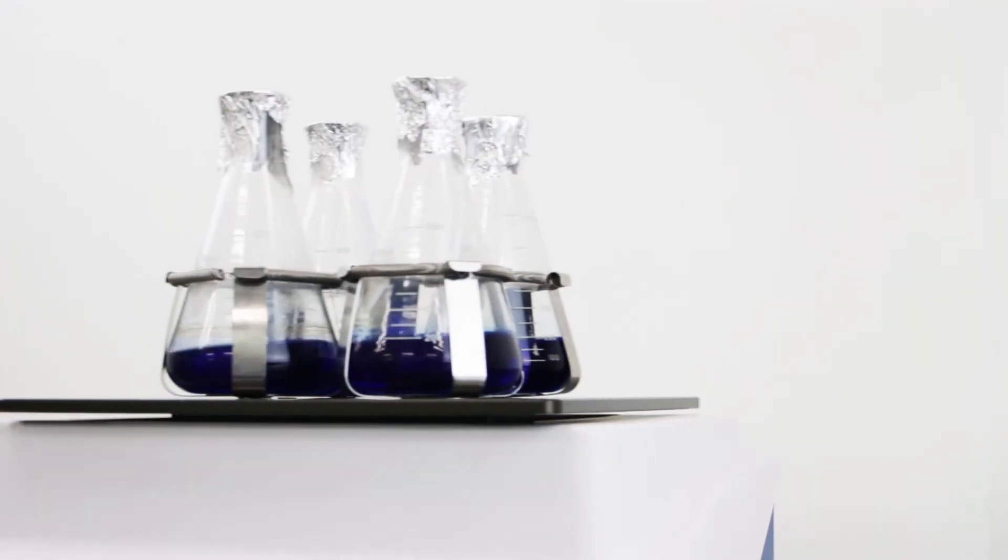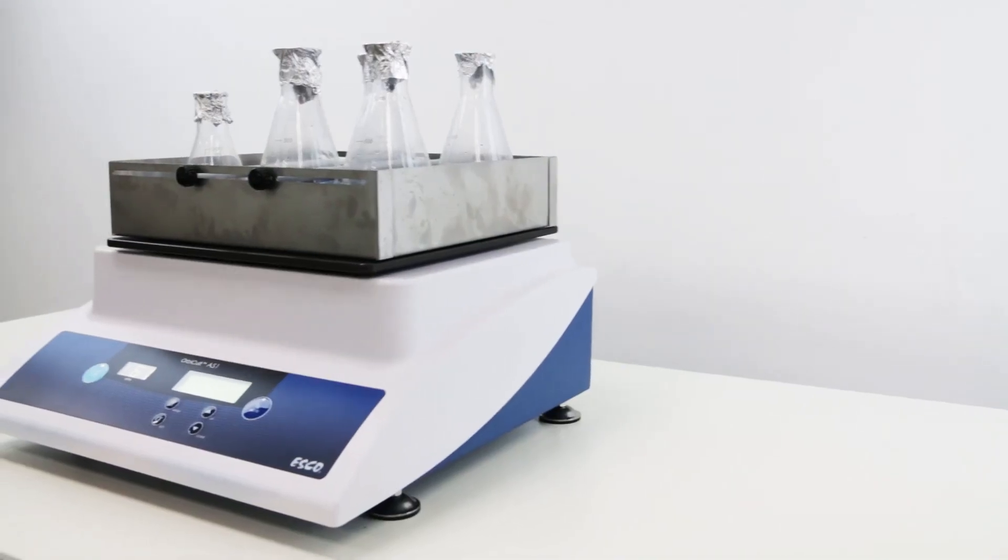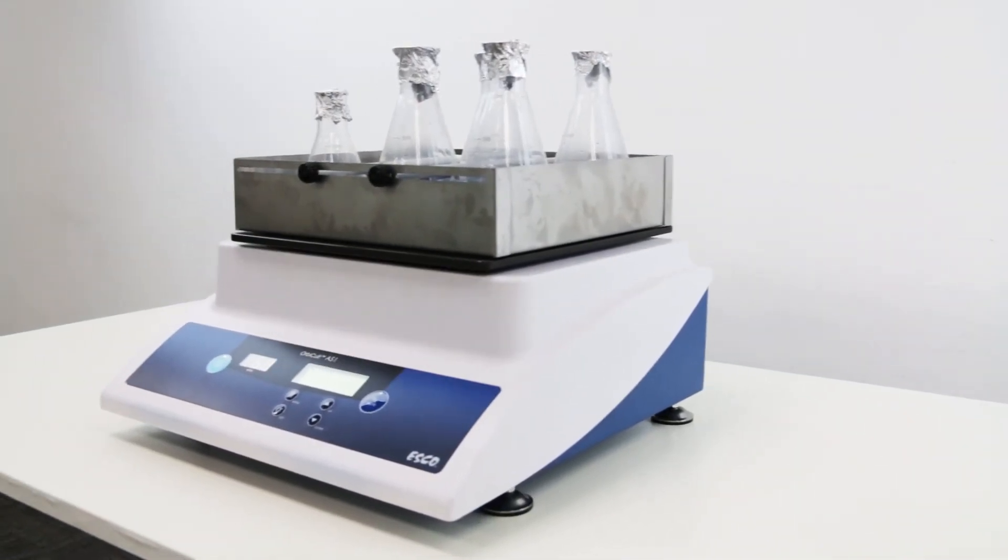Making sure that Esco OrbiColt Ambient Shaker delivers outstanding features and excellent performance. Let Esco OrbiColt Shaker become a part of your laboratory.